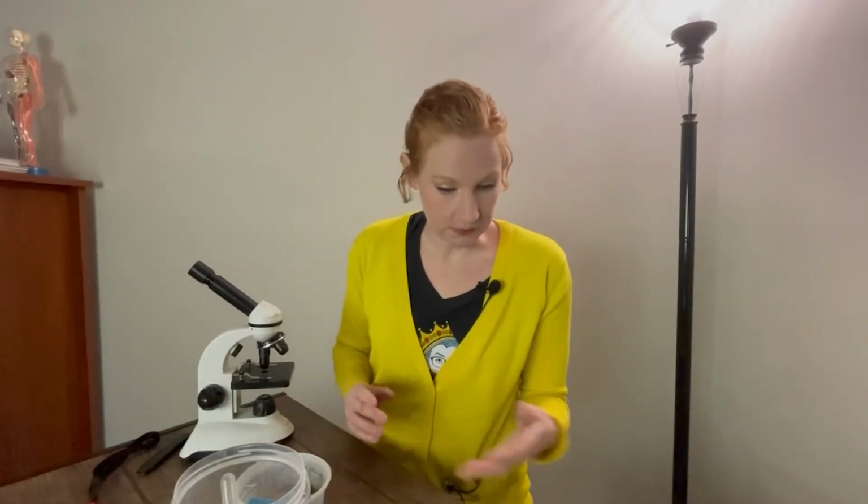All right, so now that we know a little bit more about microscopes, let's look at some cool things under a microscope. Now you might be wondering where to get some microorganisms, and a good place to get them is in a pond. All you need is a microscope, of course.